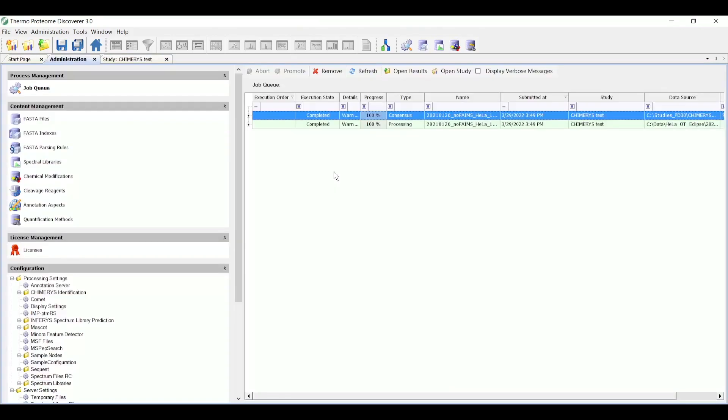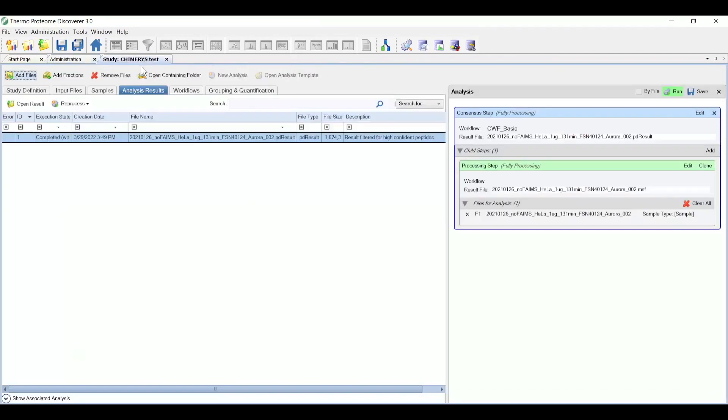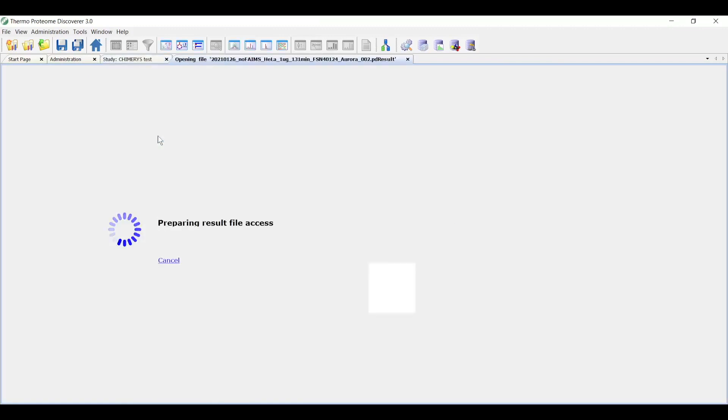Here I'm showing the run queue after both the processing and consensus workflows have finished. I can either open up the result file by double-clicking or clicking the consensus workflow, clicking open results, or I can go back to the study, look at the analysis results tab, and double-click the results from there.